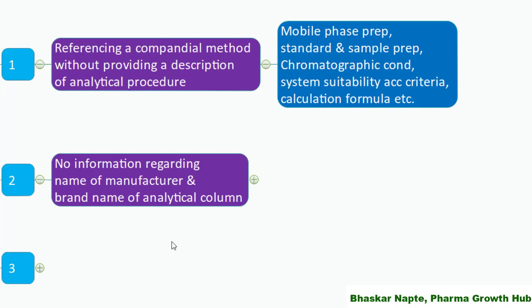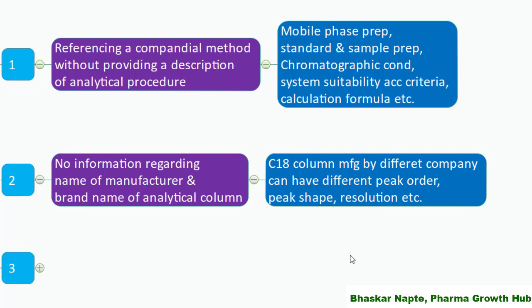The second important point is: no information regarding the name of the manufacturer and brand name of the analytical column. USP might have given the usage of an L1 stationary phase, but in the L1 category you will find thousands of column manufacturers. In liquid chromatography, the performance of the column will vary from one manufacturer to another, so it is very important not to just mention C18 or L1 stationary phase but also mention the manufacturer and column brand name, because different brands can have different peak order.